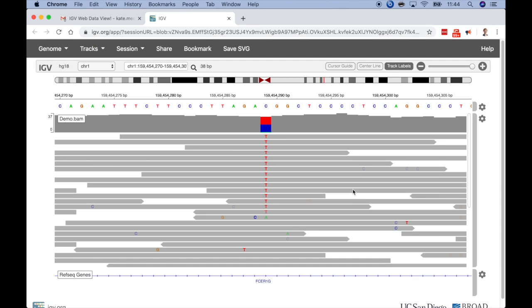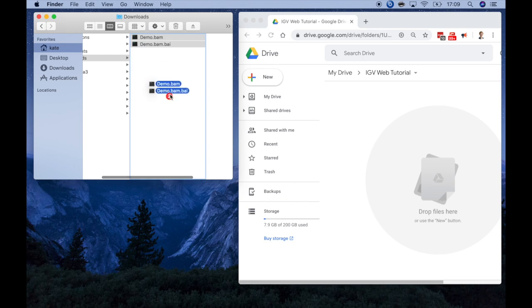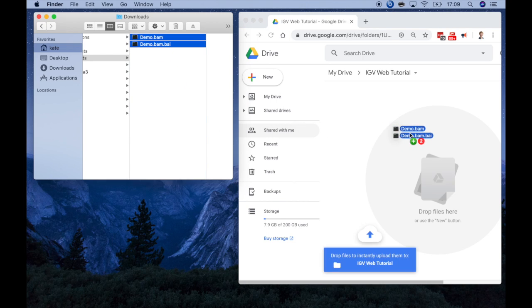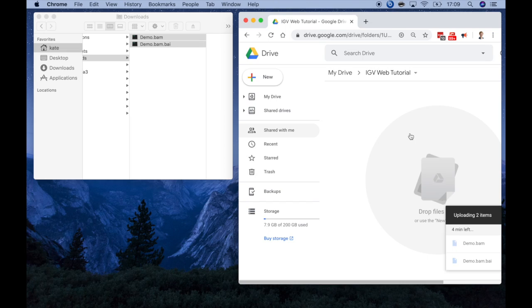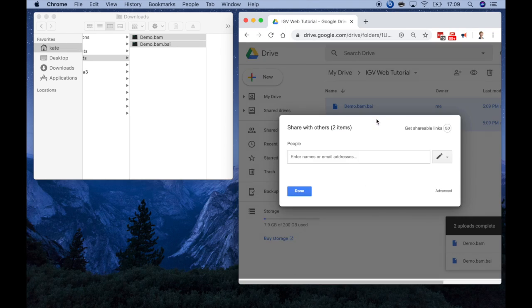But let's go back to the beginning and say that I'm not a Dropbox user, and I prefer keeping my data on a private Google Drive. In this case, I will need to explicitly share the data files with my colleagues on Google Drive. Here, I'll share the data with my colleague Kate.